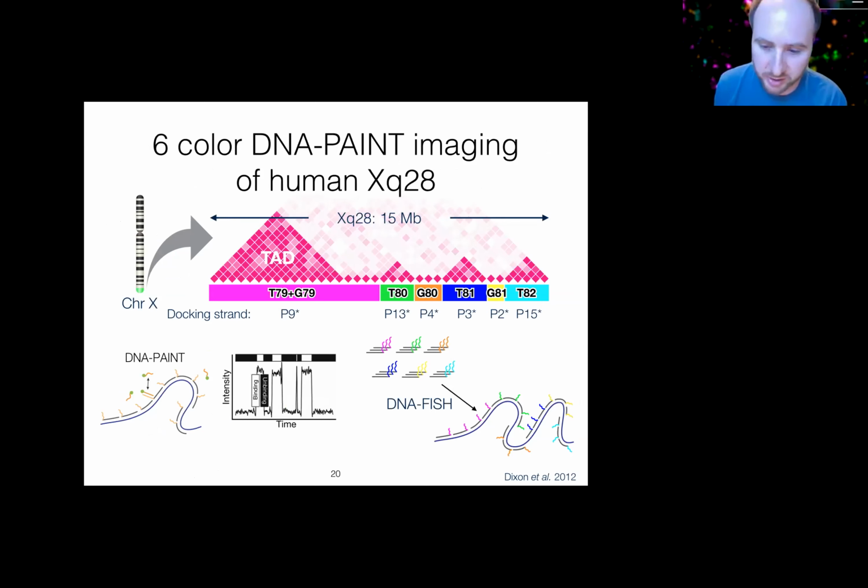So what we've done here is design an Oligopaint library that targets this 15 megabase or so region of the human X chromosome. The specifics of how the targeting happens is not so important for this, but for what it's worth, the library design was in part inspired by a data set with topologically associating domain calls from Bing Ren's lab that Jesse Dixon published a long time ago, the original set, that is, the 2012 paper. But I think more importantly for the purposes of the next couple slides, this is really just to illustrate the power of what this kind of imaging potentially can do in a multiplex context.